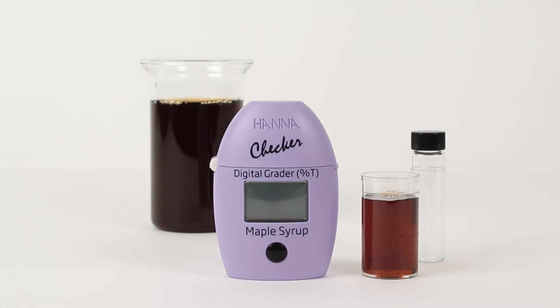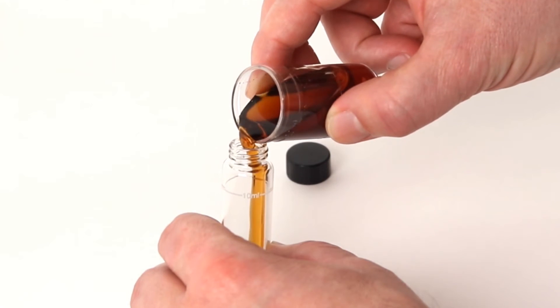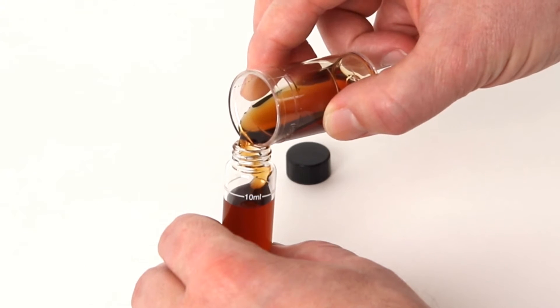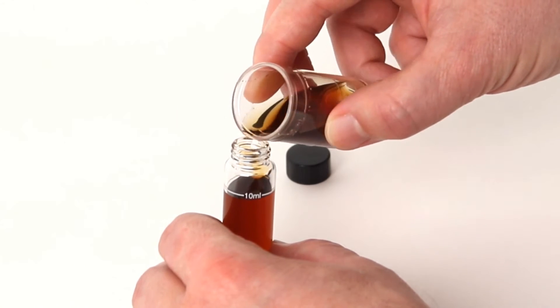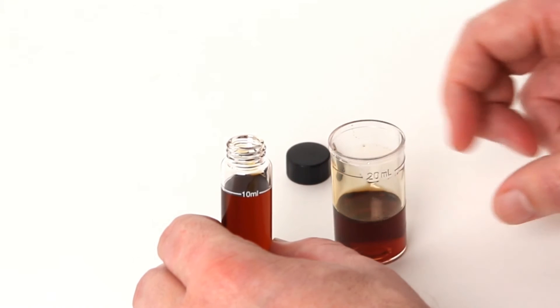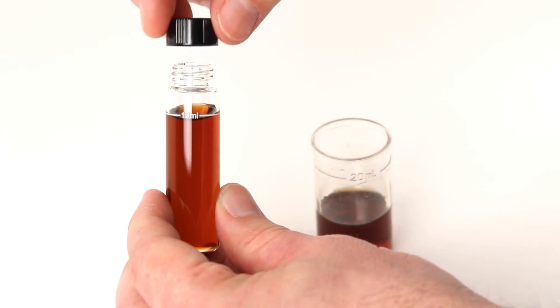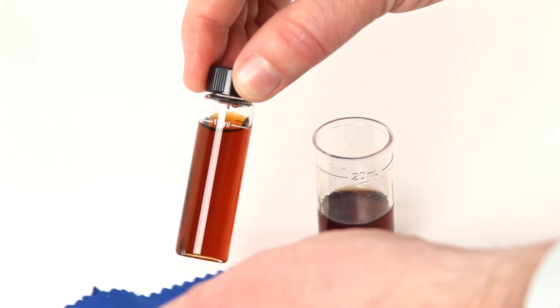You're also supplied with an instruction manual and quick reference guide. The first thing you'll want to do is prepare your maple syrup sample or samples. Simply pour your maple syrup for grading into a clean dry sample cuvette up to the line using the beakers provided. It's important that all of your materials are clean, dry, and don't leave bubbles when adding syrup into the cuvette.